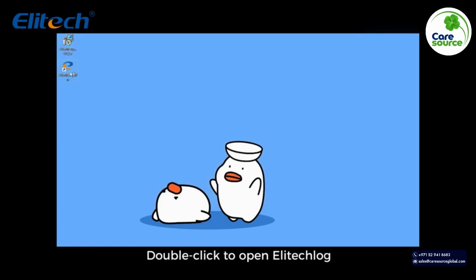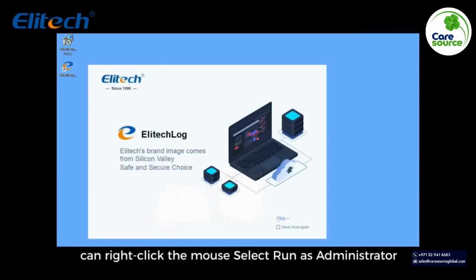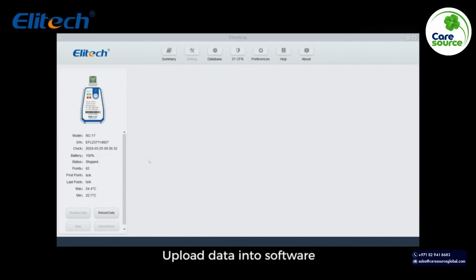Double-click to open ELITechLog. If double-click fails to open, you can right-click the mouse. Select Run as Administrator. Then you need to connect the device to the computer. The software automatically identifies the device. Upload data into the software.